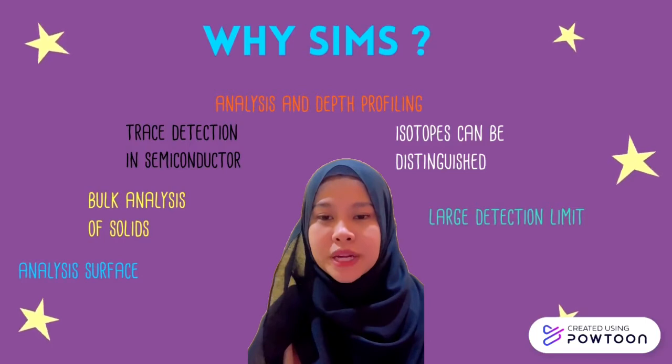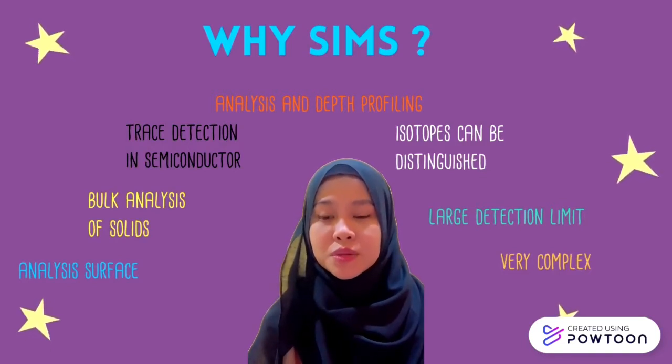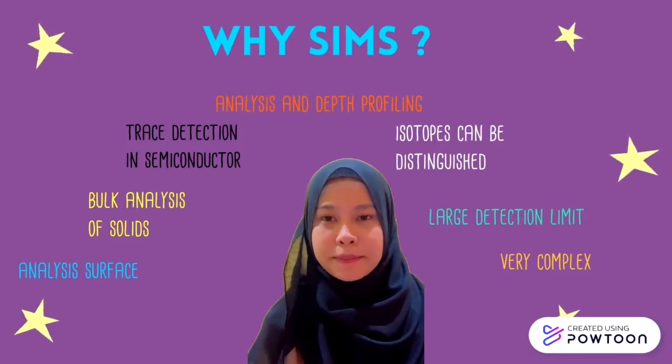However, mass spectra in SIMS might get very complex. The reference materials must be very similar to the sample to be investigated, and sputtering yields are highly dependent on the chemical composition of the sample.